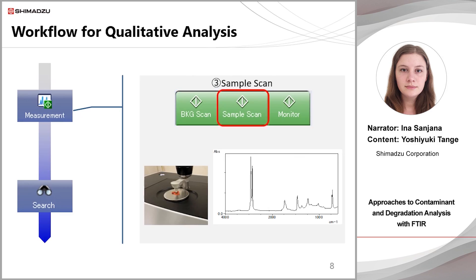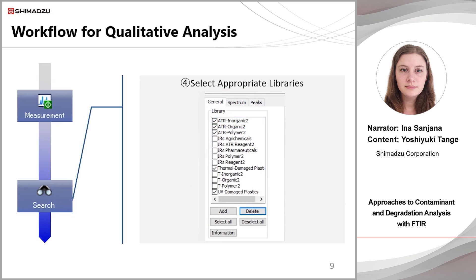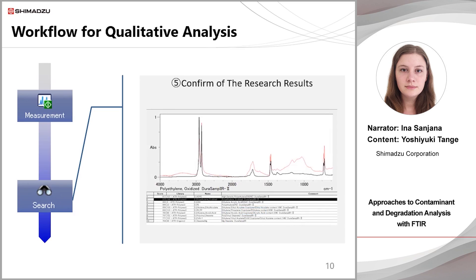After the background scan is complete, the sample is placed on the ATR prism and compressed by the sample clamp. Now we can perform the sample scan. The infrared spectrum, shown on the right, is obtained. Then we perform a search for the obtained spectrum in the selected libraries. The libraries are categorised by measurement methods, or by sample types, such as organic substances or food additives. It's important to select the appropriate libraries. After the spectrum is searched, matching spectra are displayed in order of similarity. Check for the best results by referring to the numerical scores and the peak shape.